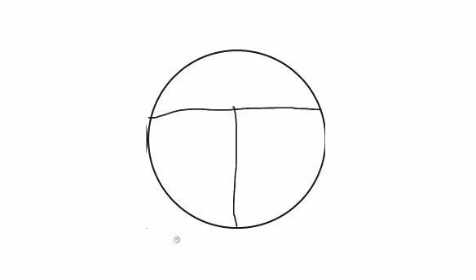The next thing we will do is use our loop, indicated here by my cursor, to pick some bacteria off of your source plate. When we have our bacteria from our source plate on our loop, we will, in your best 3-year-old scribble, color in this top portion, moving from one direction to the other. Notice how I did not go backwards. I only moved, in this case, from left to right.